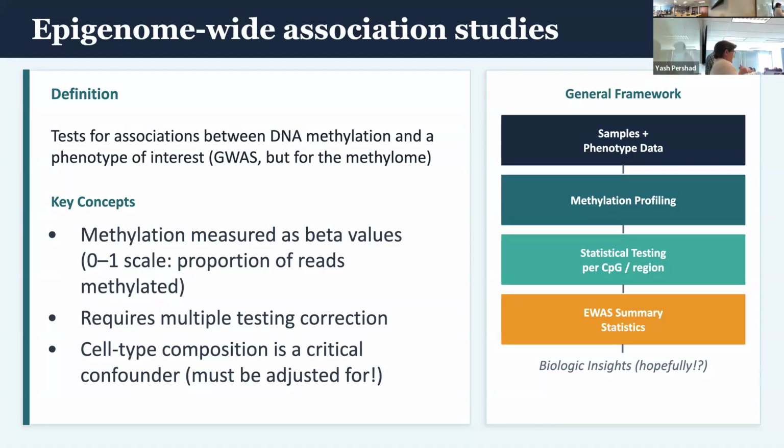I'll just jump in quickly. In addition to controlling for the major cell type proportions, so typically lymphocytes and neutrophils, we should also include technical effects here. From that PCA of proportion methylation, we often include usually between 2 or 3 technical effects. That's incredibly important if you're combining across batches. If you know about sequencing, batch effect correction can be quite challenging. So I would give a strong word of caution, obviously for any study, but particularly for sequencing-based technologies.